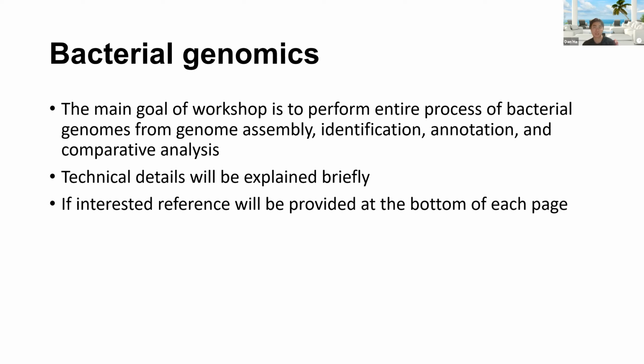Bear in mind the technical details will be explained in a brief manner, because I want everyone to follow along with the pipeline and command lines that I'm going to provide. If you're interested in further details about the algorithms of each program, there will be a reference provided at the very bottom of each page.